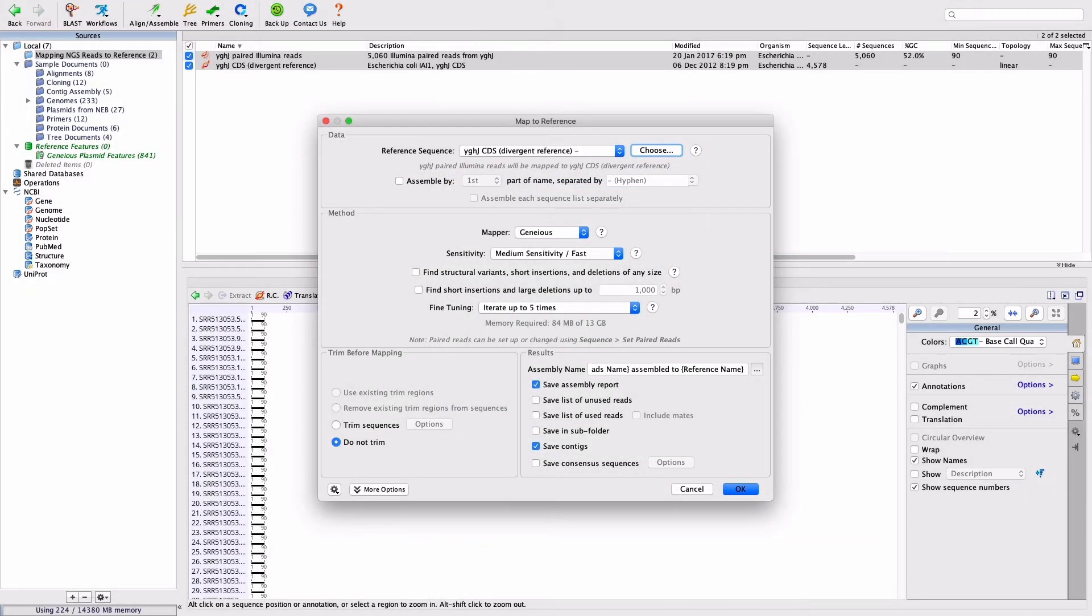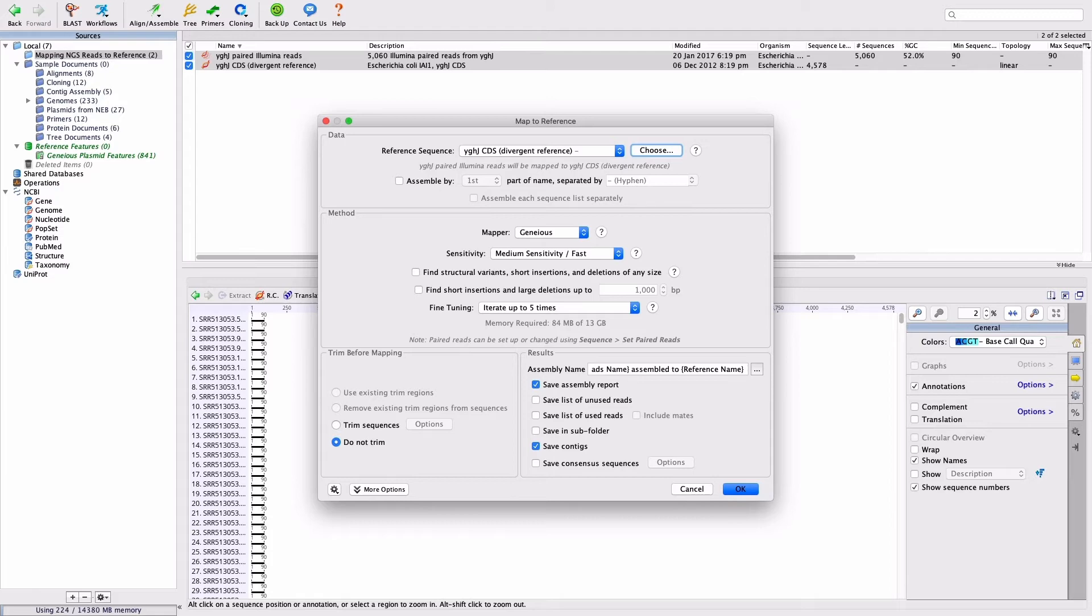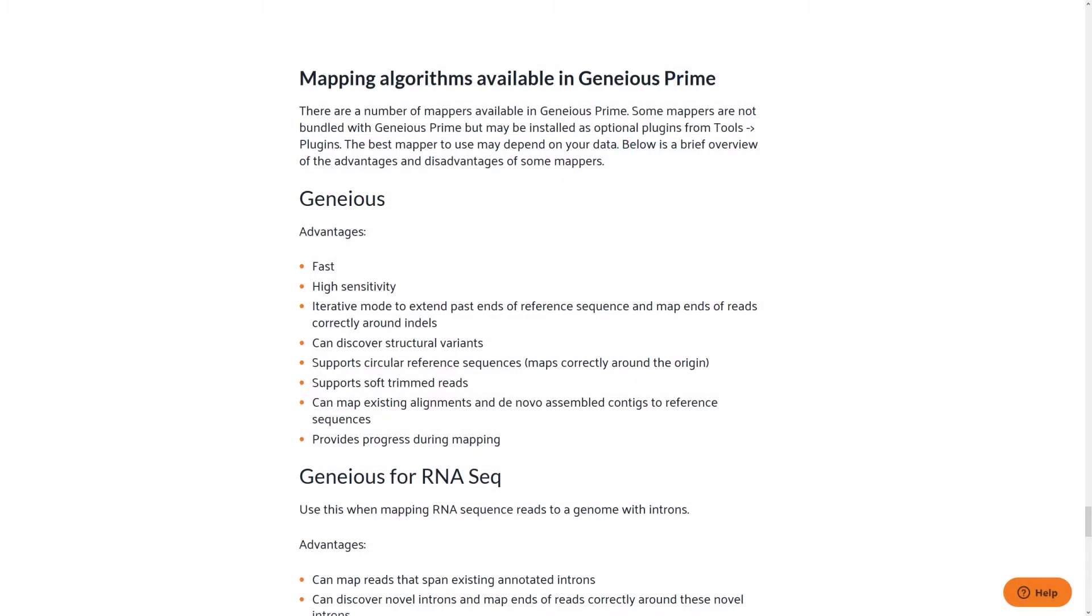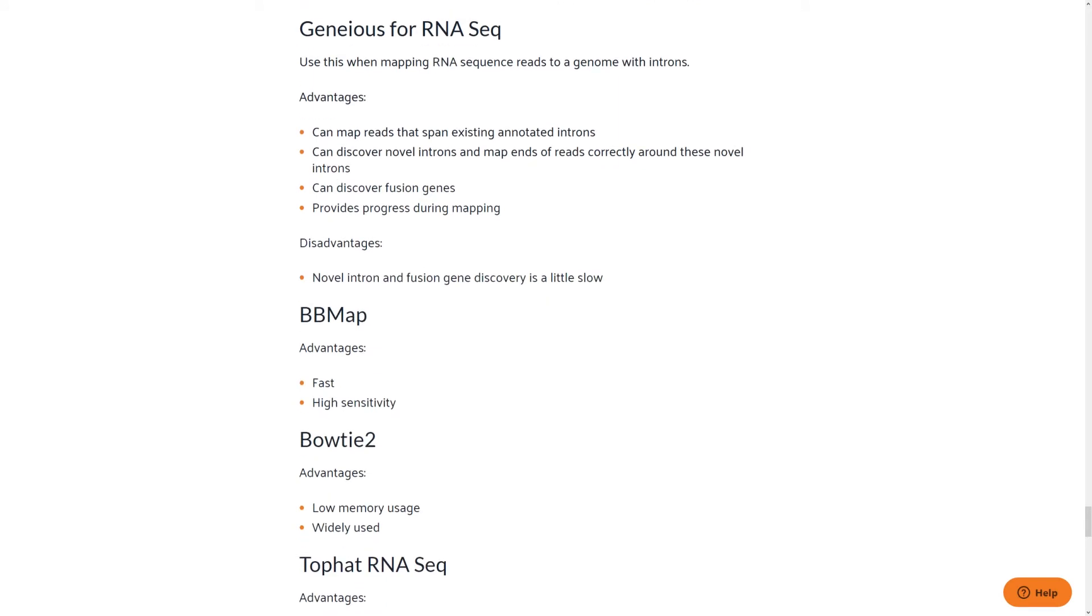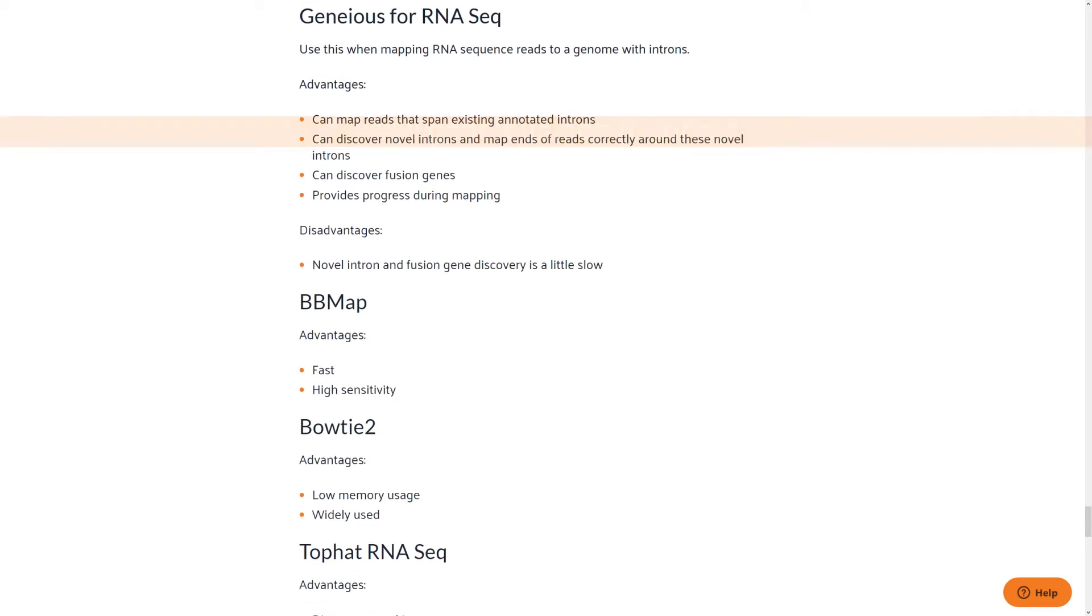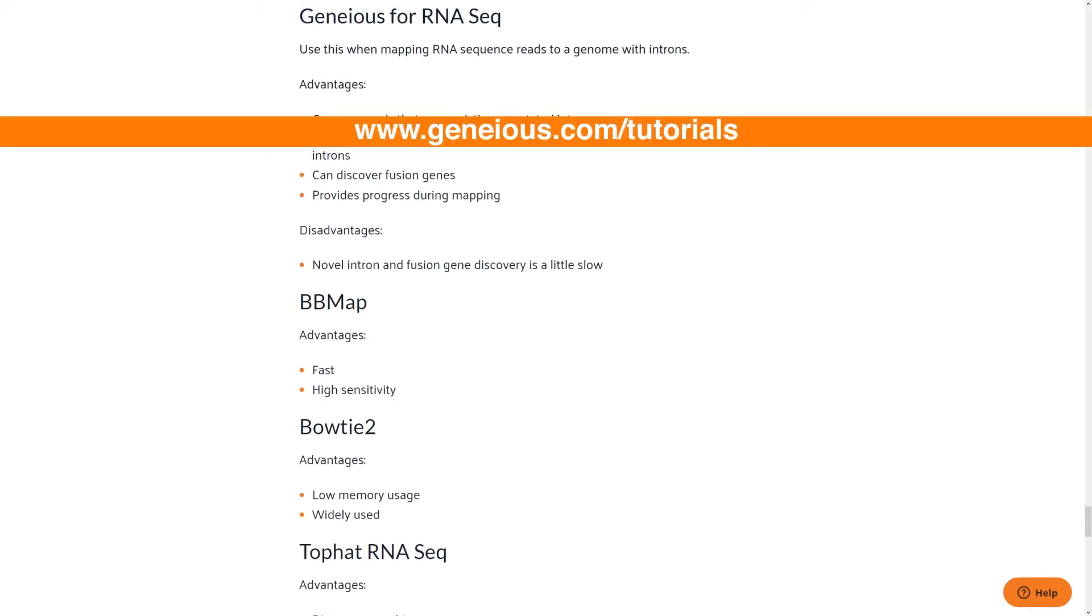In the Method panel, select Geneious as the mapper. A number of different mapping algorithms are available here, and these have varying strengths and weaknesses depending on the type of data you are assembling. A brief outline of the different algorithms available is shown in the tutorial section of our website.